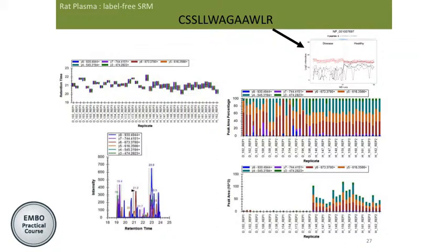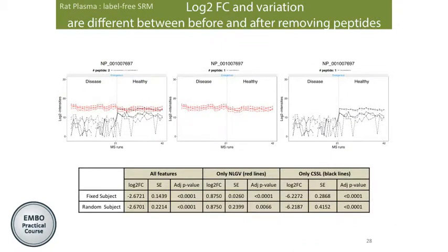Across this chromatography something is going on, with the measurement or something else, I'm not sure. Depending on your decision, you may want to use both, or just the red peptide, or the black one. The conclusion is different.